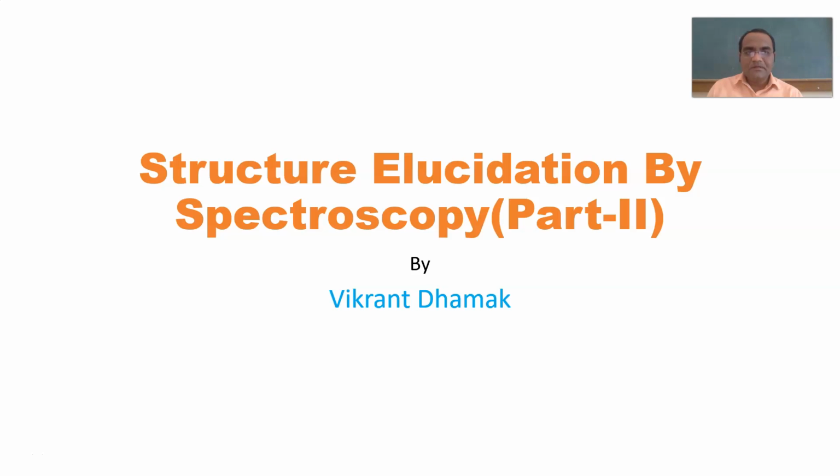I am Vikrant Dhamak. In this session we will be looking at structure elucidation by UV as well as IR and NMR, and here the molecular formula has not been given, only the molecular weight is given in the problem.